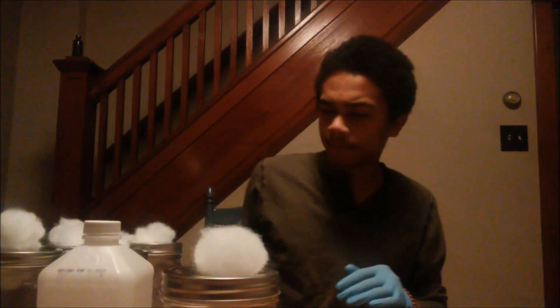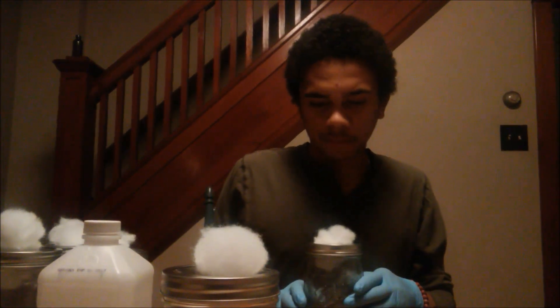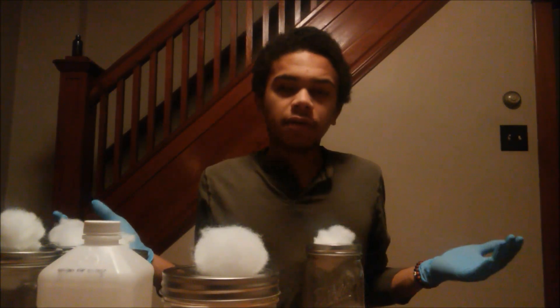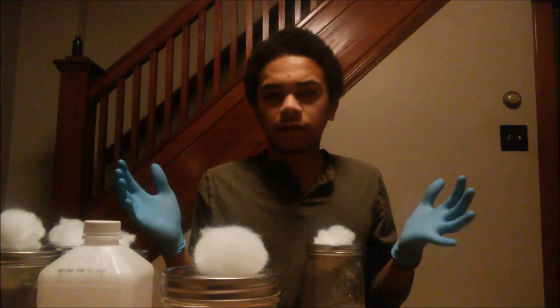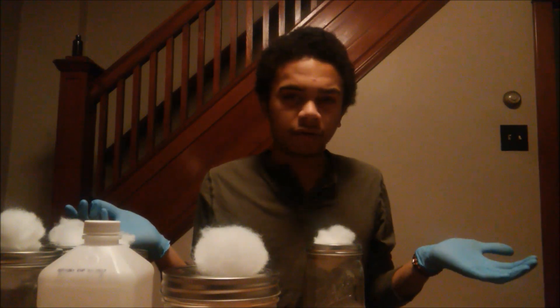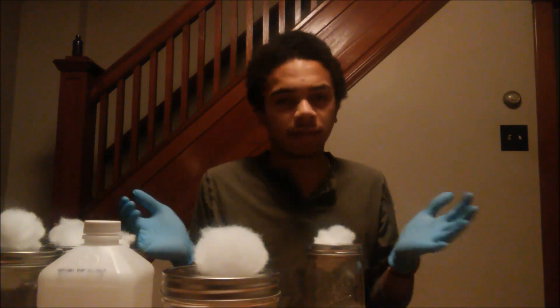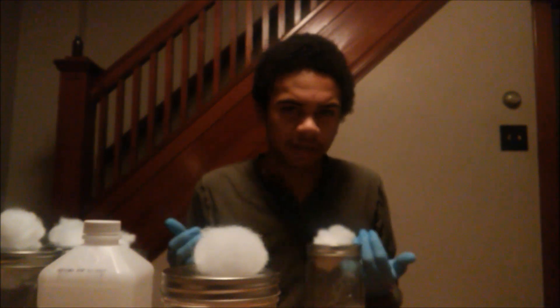Store it in a nice dark room-temperature area — closets are good. If you need to know where to find a pressure cooker, you can usually find them at garage sales, yard sales, or maybe in your grandma's or parents' basement. They're not that expensive — you don't need anything too fancy.